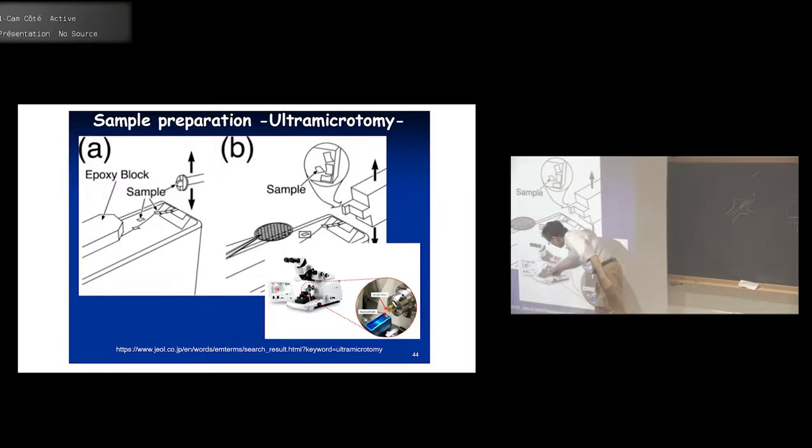And then this part is a very, very important part. Okay, you have a sort of swing bar, and at the tip you have a sample. The sample is prepared so that you have a sample, and then you embed it in epoxy resin. Okay. And then after that, you trim the surface, the tip. That's why it looks like this, so that the sample appears at the tip of this sample block. And then we mount this, and this is the knife, and here it's the knife actually.